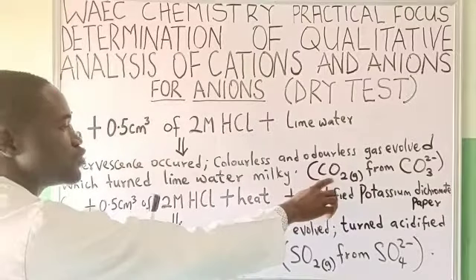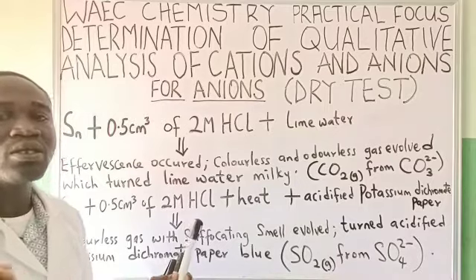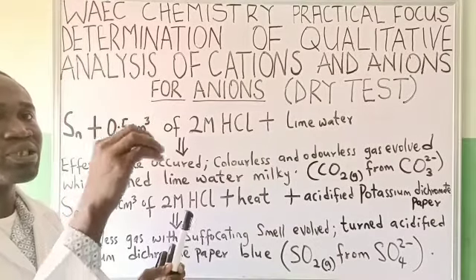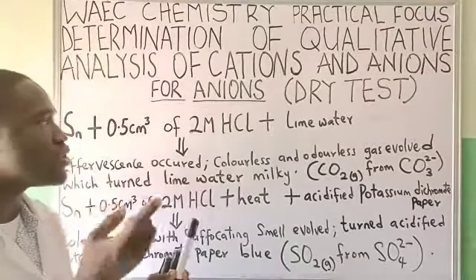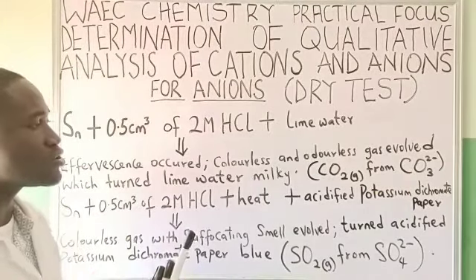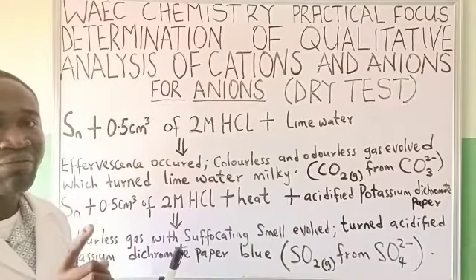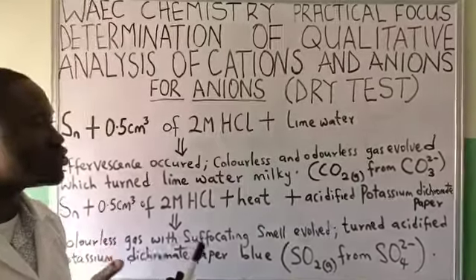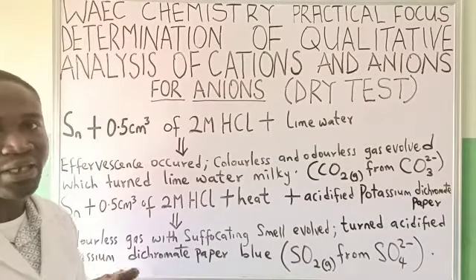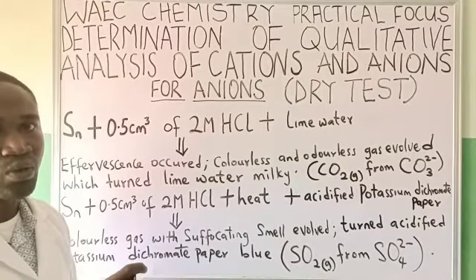That is CO2 gas. The reason why we are using the salt in the Sprite to see what effervescence looks like is because CO2 gas is one of the preservative gases used to preserve all these carbonated drinks, Coke, Sprite, and so on.